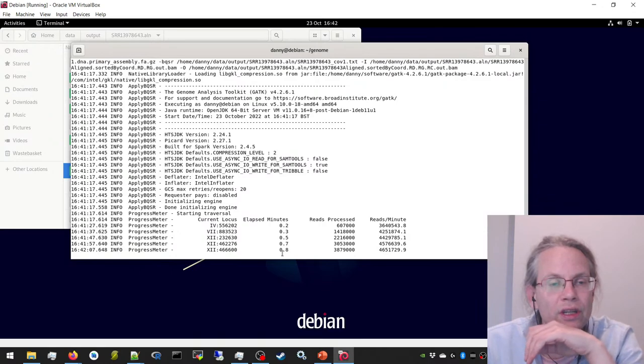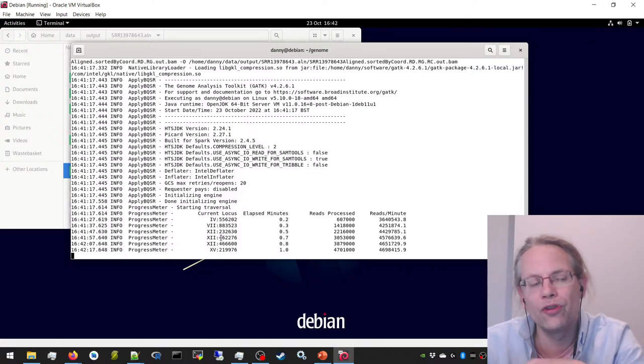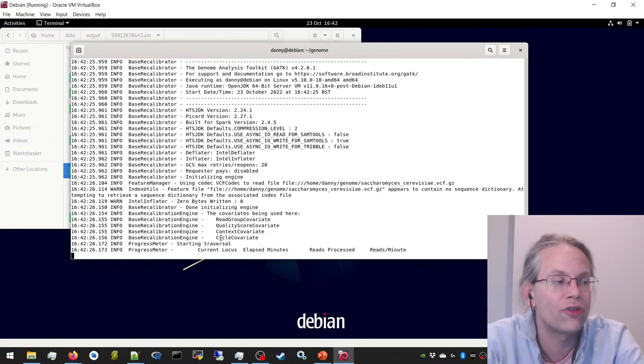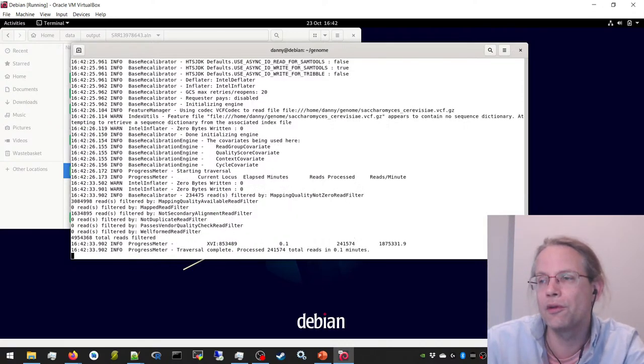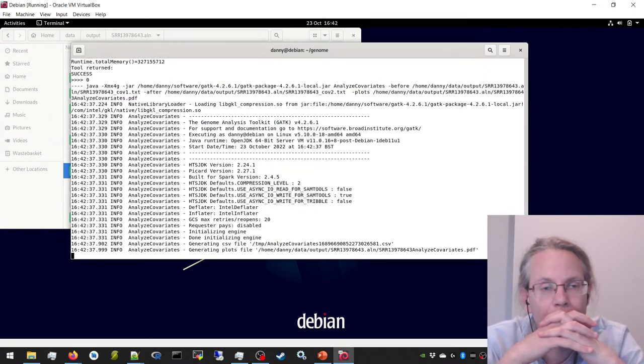And you can actually see that it's taking a long time on chromosome 12, right? So chromosome 12 is not aligned properly. There is something weird there. Have we already seen that from the initial flagstats? No, not from the flagstats, from the initial coverage. So there is something weird going on.